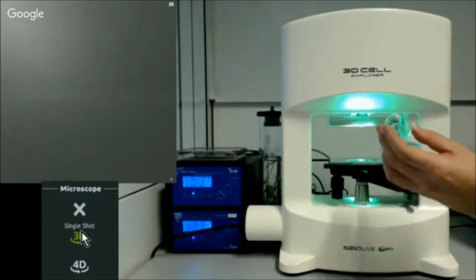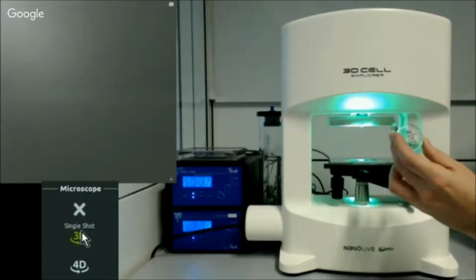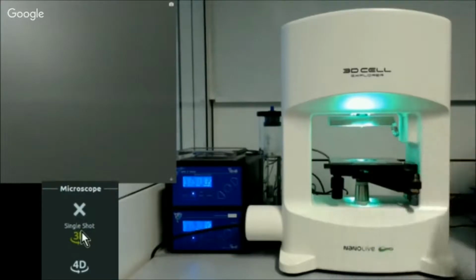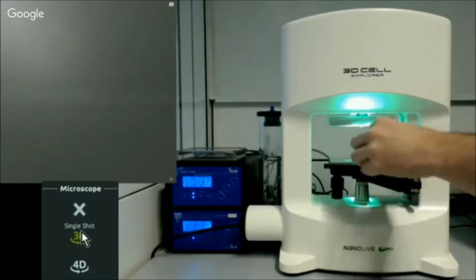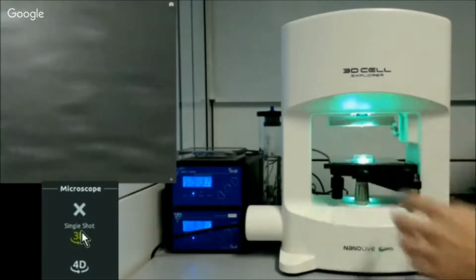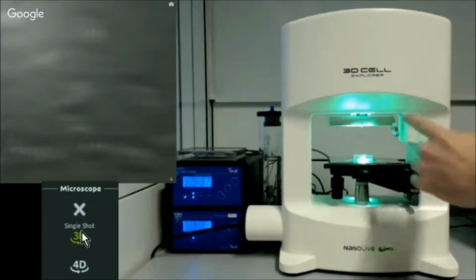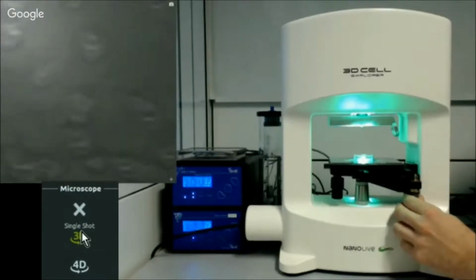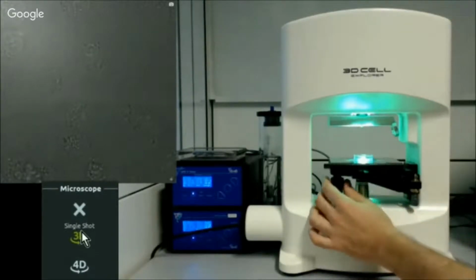So here we have some HeLa cells. Those are a very well-known standard. So very simply, you take your cells and place them on your stage. You can see there this green light, which we use to illuminate the sample so that we can see during the focusing. Voila. We are pretty much in focus. Yeah, we can search for a nice spot like this.